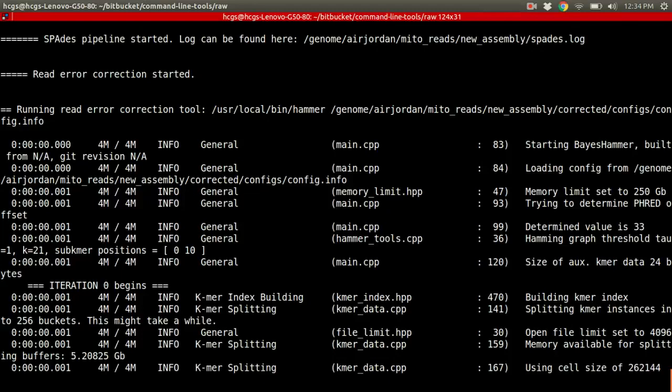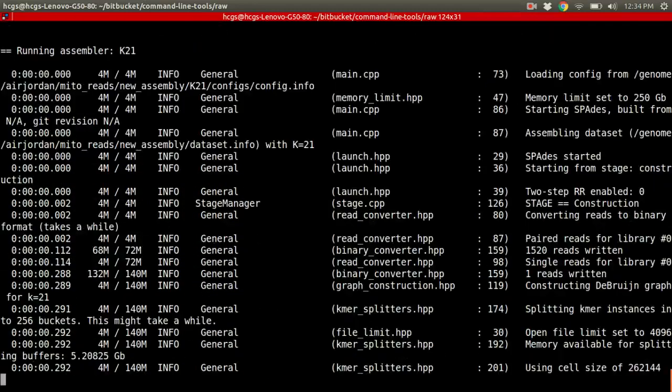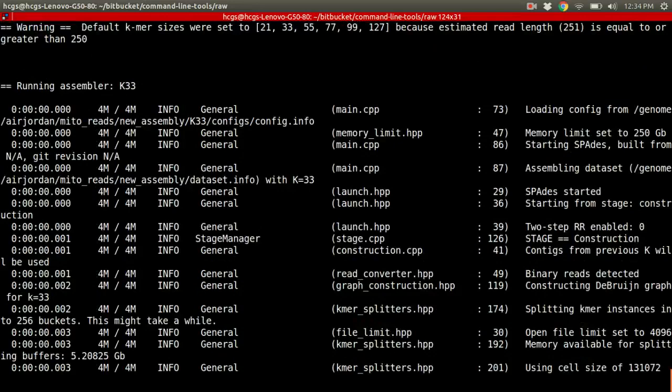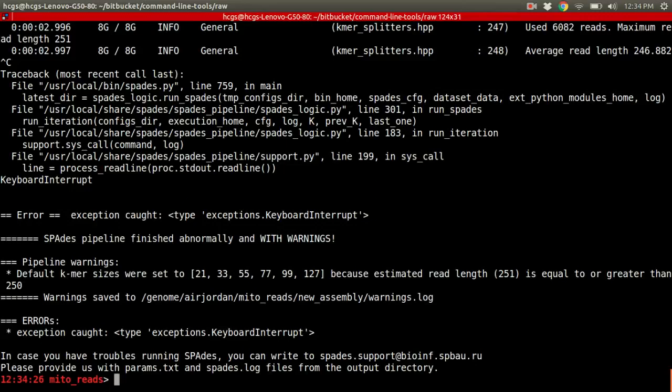So I'm just hitting enter again. You'll see this is running through everything. Now, I timed it before, and I think this takes 7 to 8 minutes. So what I would like you to do is have this finish running and get the results before moving forward. You should, at this point, just pause the video and finish up on that.